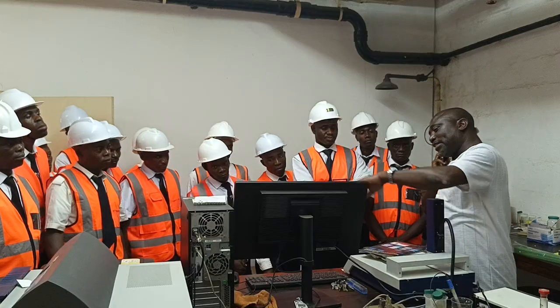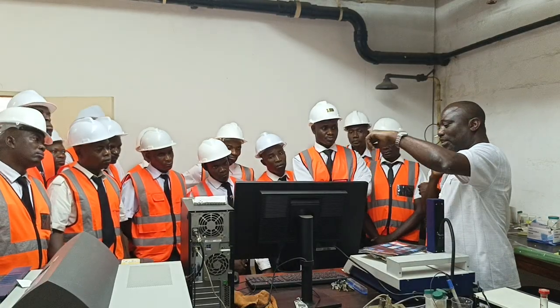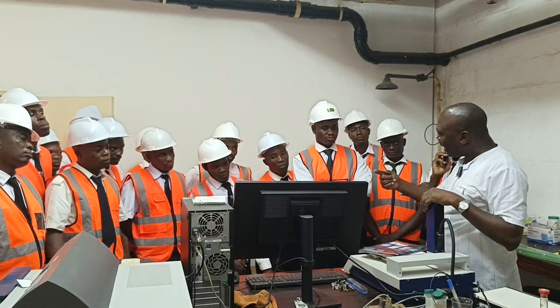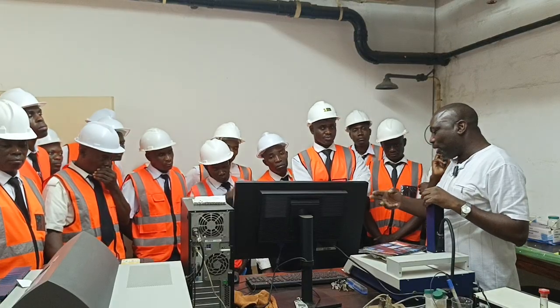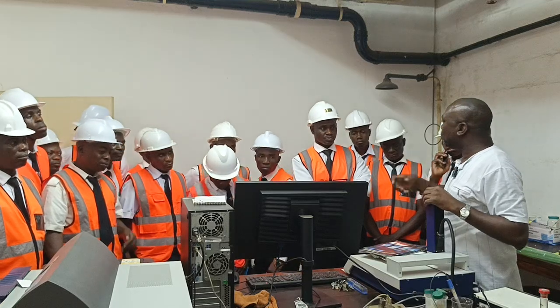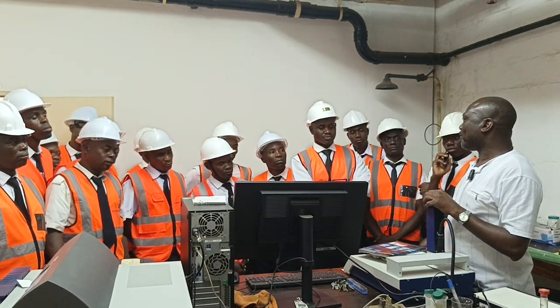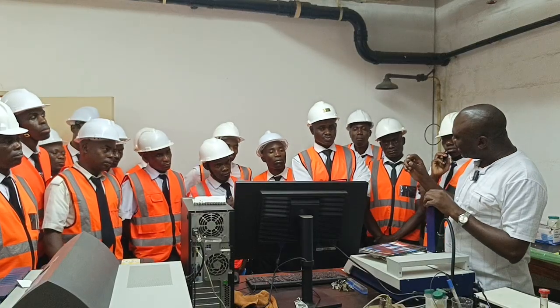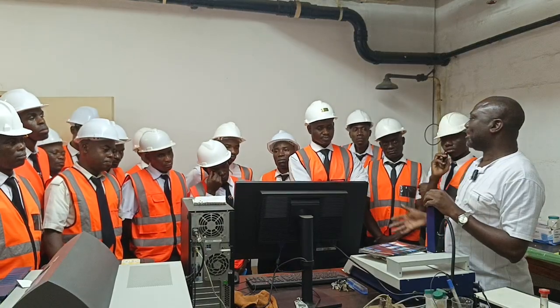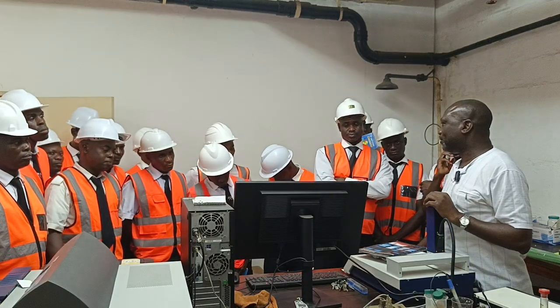And how it calculates is, you look at the blue color there, so it will calculate the total area under that blue color. The total area in that blue color is directly proportional to the amount of substance that is present in that sample. The smaller it is, it means that it is less. The bigger it is, it means that there's too much quantity.